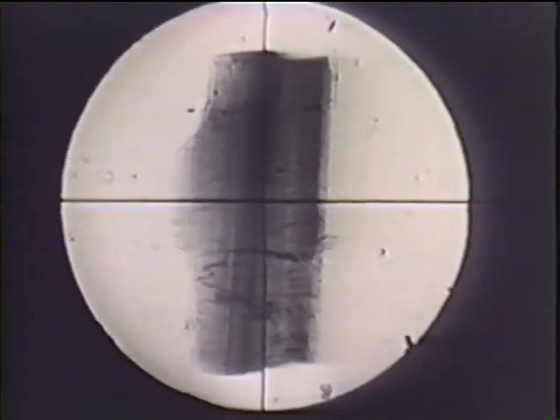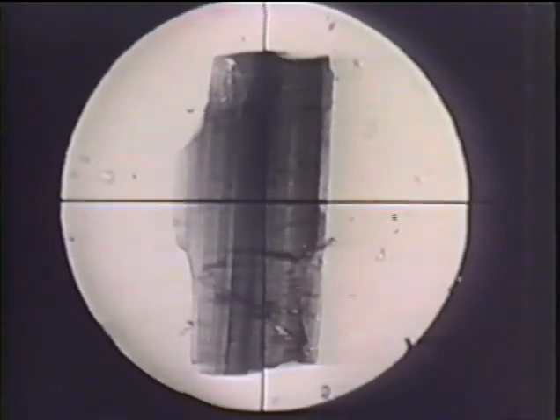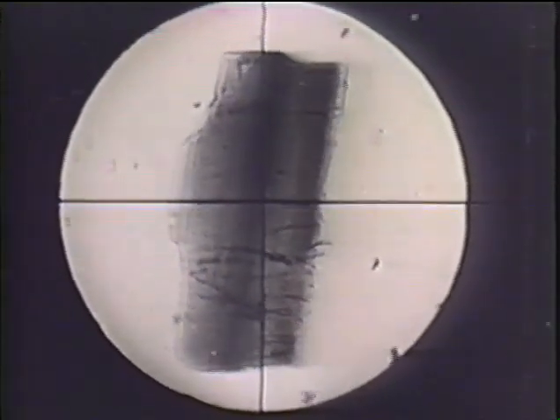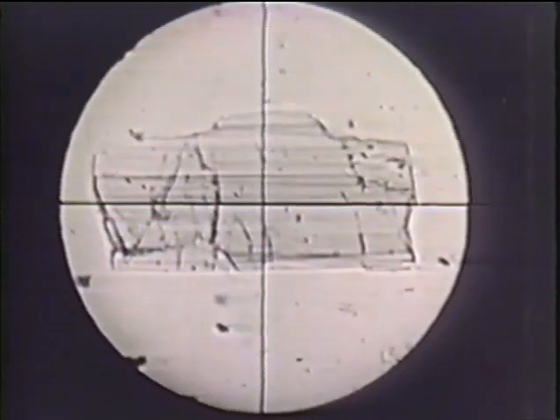Next we turn the stage through 90 degrees. Now the light is vibrating at right angles to the prism. There is again a Becky line and it now moves outward as the objective is lowered. This time the index of the crystal is higher than that of the mounting medium. Thus we have proved that tourmaline has different refractive indices for the two principal vibration directions. One is higher than that of the medium, the other is lower.